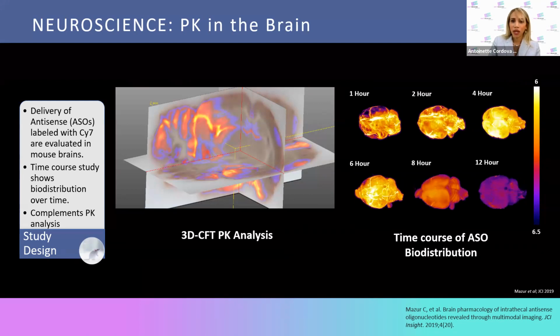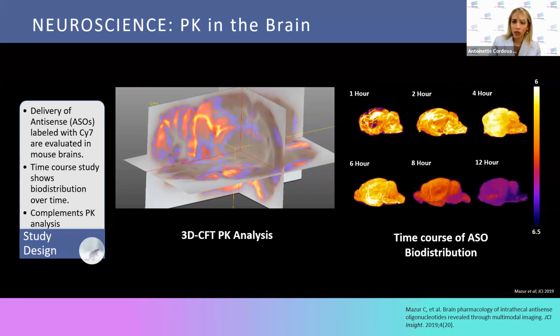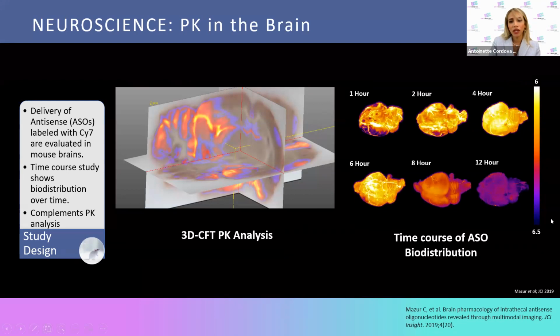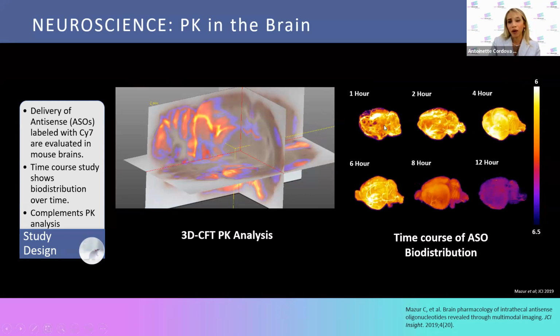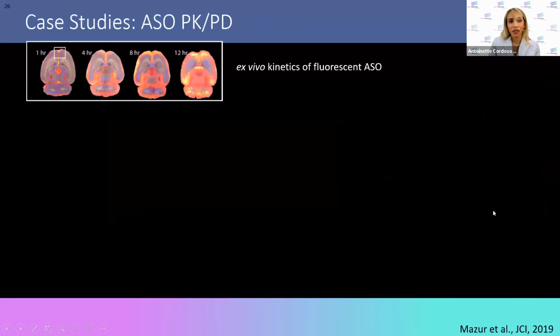There were 6 different time points ranging from 1 hour to 12 hours. And as you can see in the images here, the differences in the biodistribution from 1 hour to 12 hours are actually seen in these images.